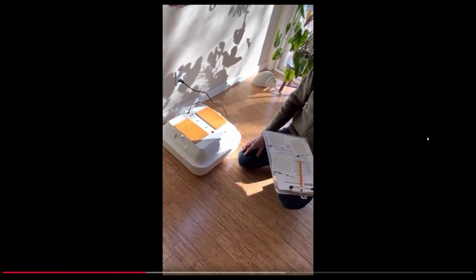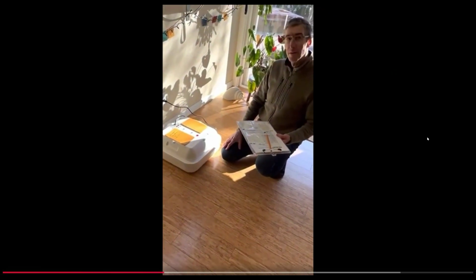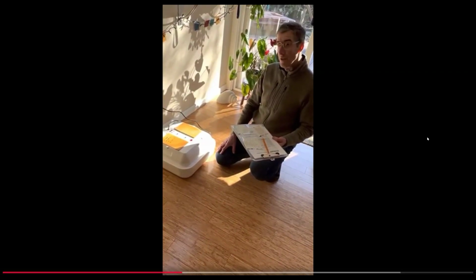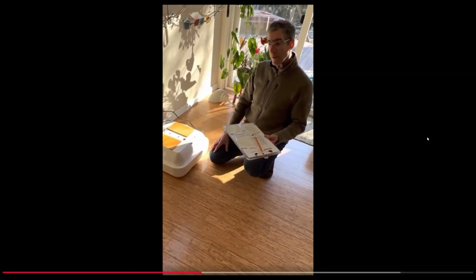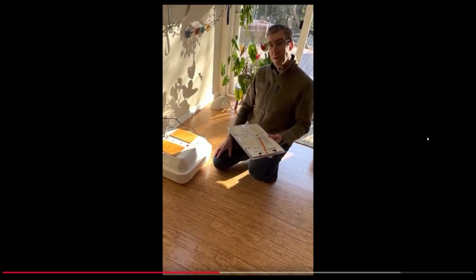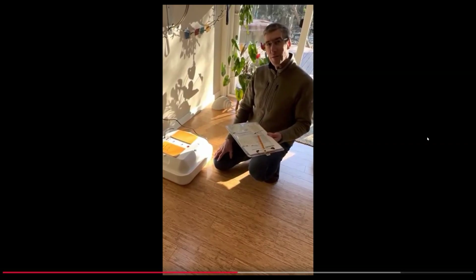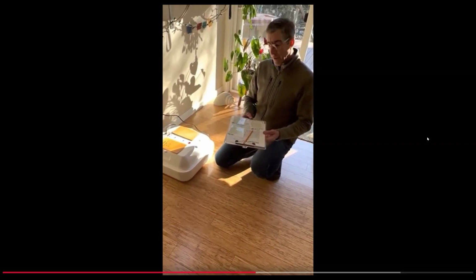With the Coliscan, you needed to incubate for 30 to 48 hours. With the R card, you really only need to incubate about 24 hours. What I've found in practice is you can read the cards after 24 hours, but they're almost easier to read if you take them out after 24 hours and then look at them the next day. The colonies have defined themselves a little bit better, but you can read them after 24 hours.